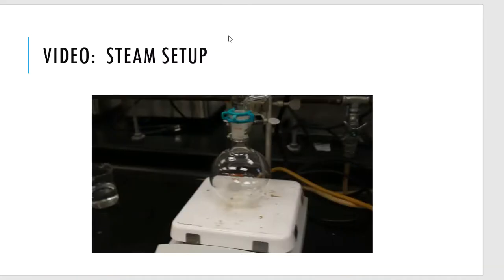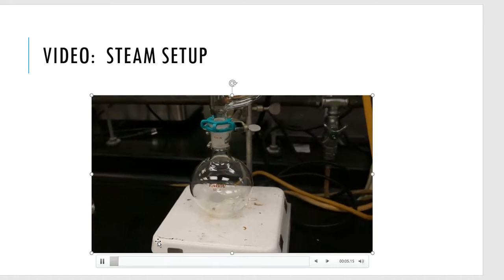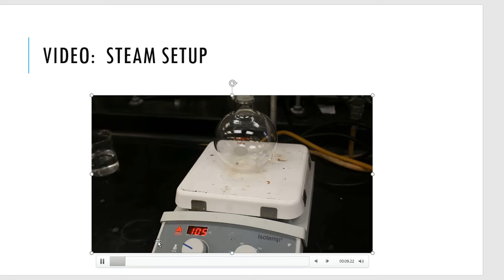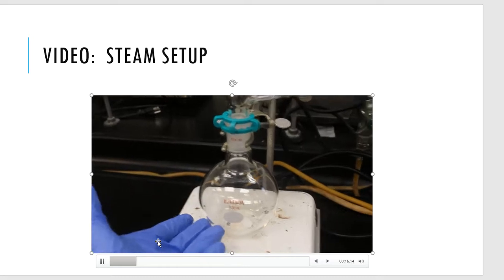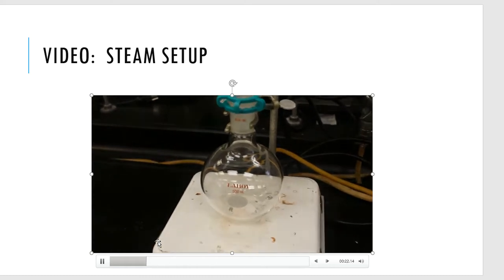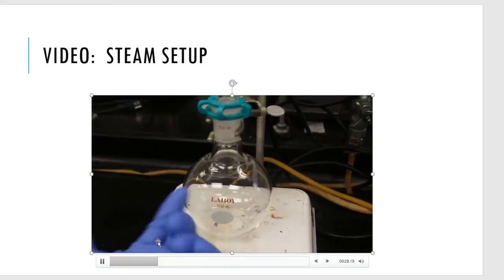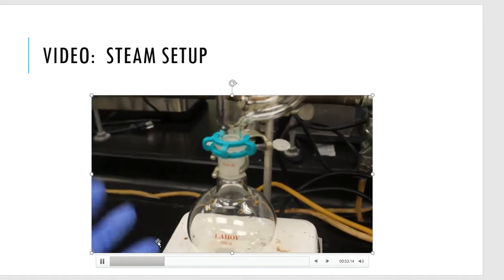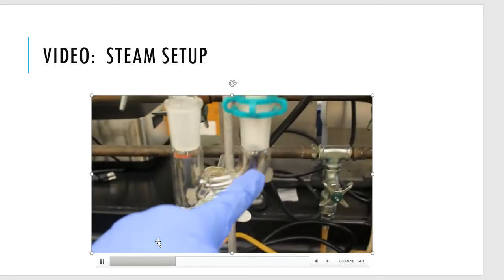Let me show you a video of the setup — a live visual of what it looks like once it's all put together. Here's just a plain old hot plate with a flat top because I've picked a Florence flask. I'm going to put water into this flask and heat it up. This is going to turn into hot steam, which is why we call it steam distillation. This steam will rise and go through the Claisen adapter.